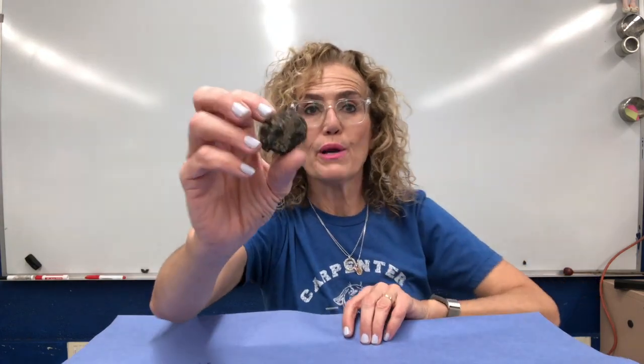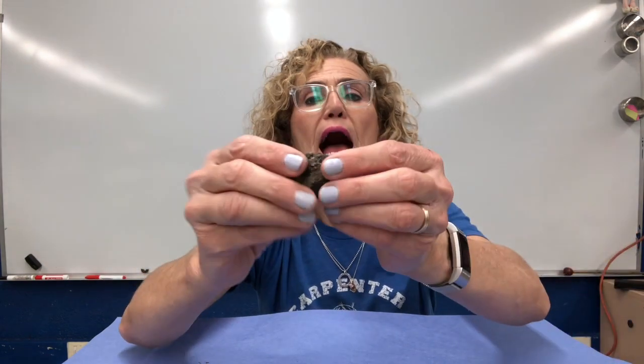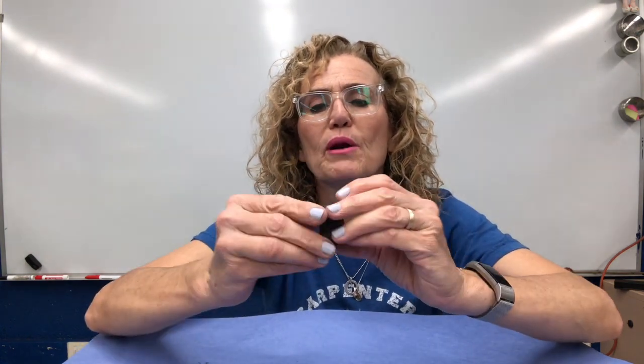Now I'm going to open up my pellet, and the first thing that I'm going to do is use my hands, and I'm going to kind of twist it, crack it. See if I can open it up a little bit. I don't want to break anything inside, but I'm going to have to. I'm going to have to break something in order to get to the center.